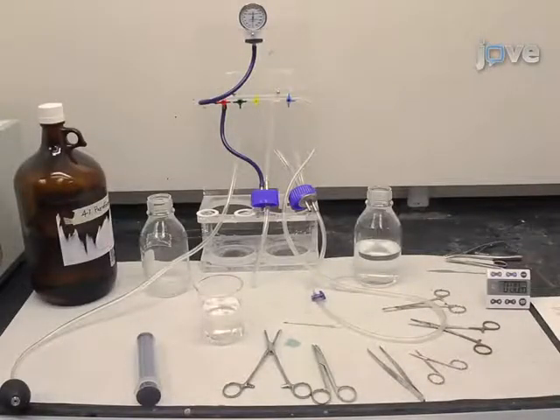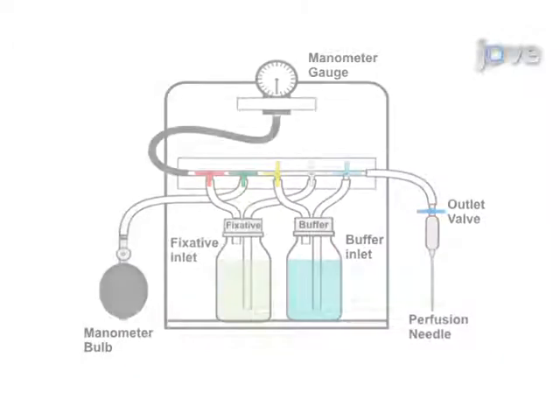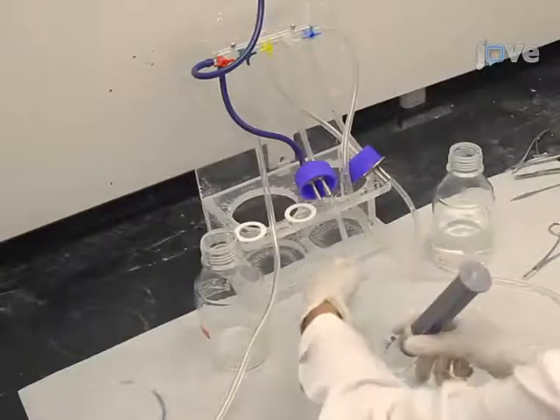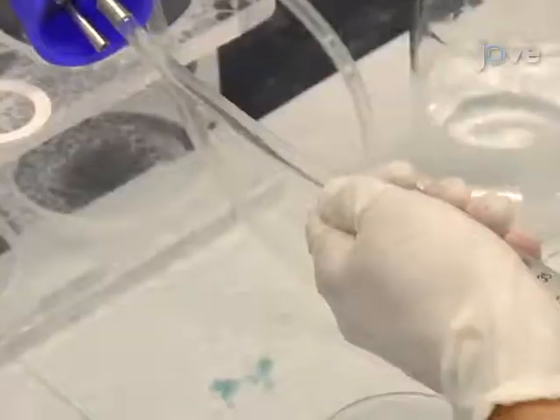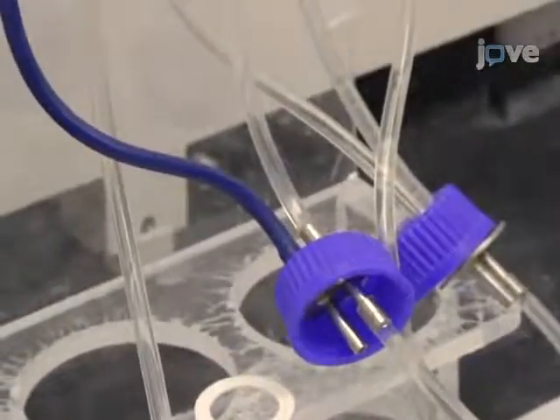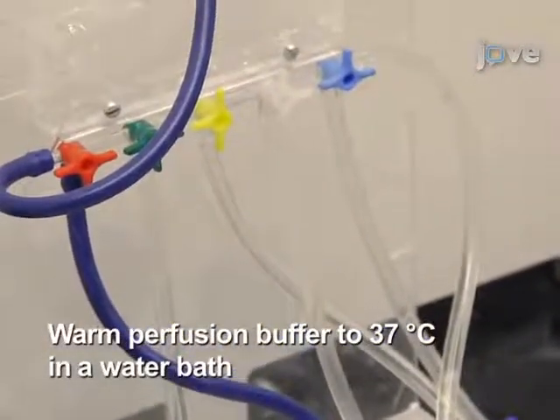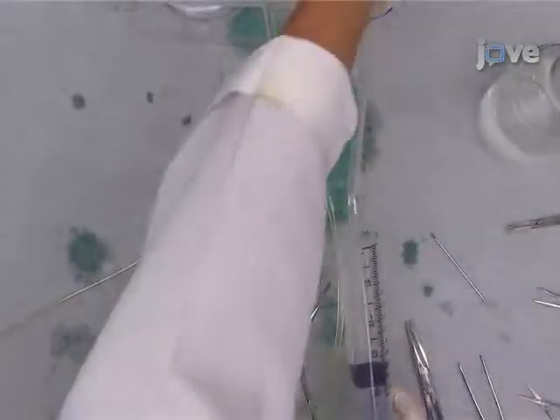We will start by preparing the perfusion rig. This will take about 10 minutes. Using a 50 ml syringe, repeatedly flush and clear the fixative line with buffer until all air bubbles are removed. It is crucial for the success of a perfusion not to have air bubbles in any of the lines. This is achieved by placing the outlet valve into a beaker filled with buffer.